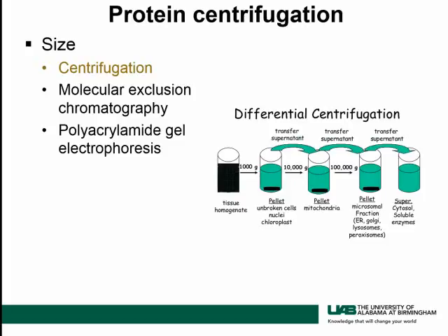You increase the centrifugal force, and you continue to increase it, to the point where only the really light proteins will be pelleted at the end, whereas the larger proteins will begin to pellet at very low centrifugal force.